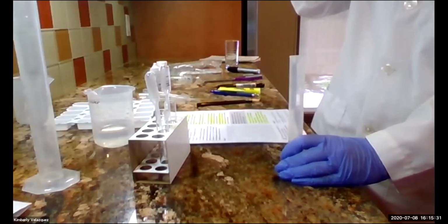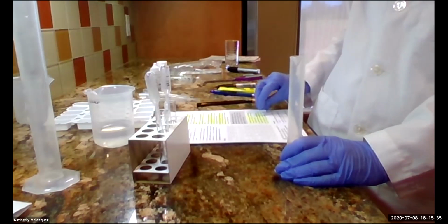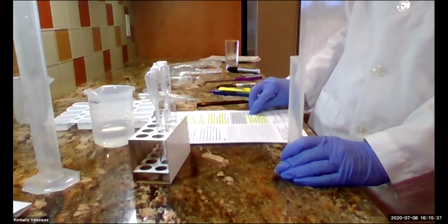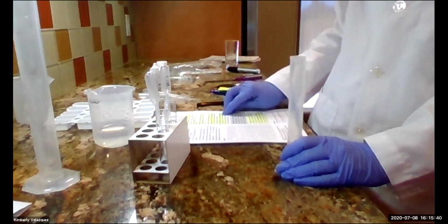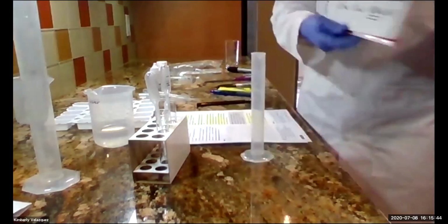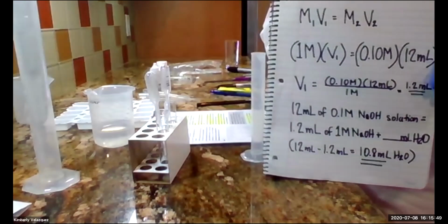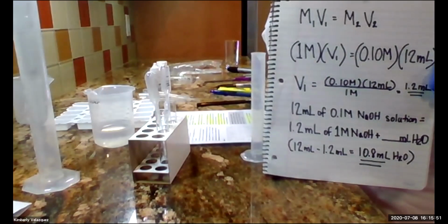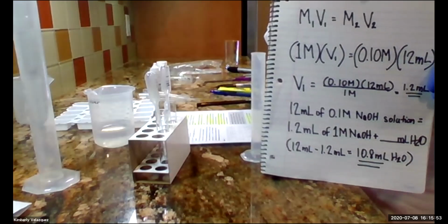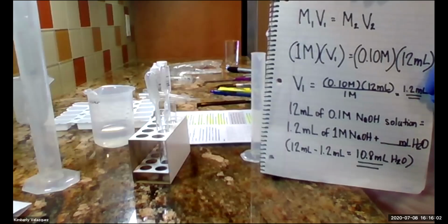What this is telling you is that to get 12 mils total of a 0.1 molar hydrochloric acid or sodium hydroxide solution, you're going to need to add, as we calculated, 1.2 mils of the acid or base and 10.8 mils of water. Really, all you need to do is add the 1.2 mils of the acid or base and then add enough water to get you to 12 mils.